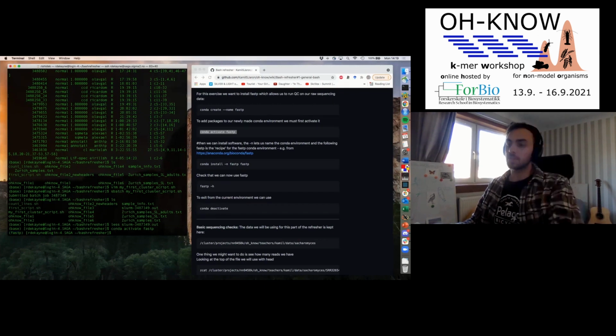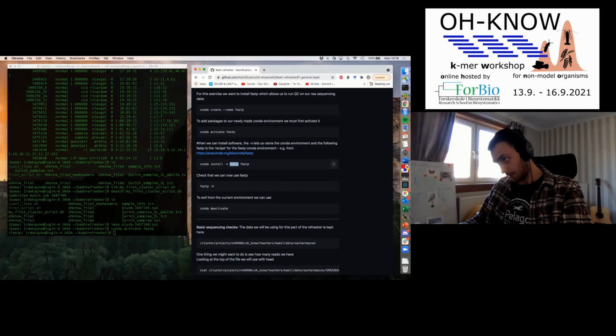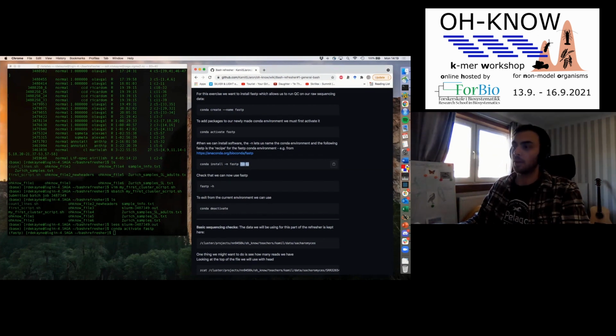When you do this, this will be like an empty environment. And what you want to do then is install the fastp software. So here, this fastp after the -n is the name of the environment we're in. This fastp, however, is telling Conda, I want you to download this program and the dependencies.